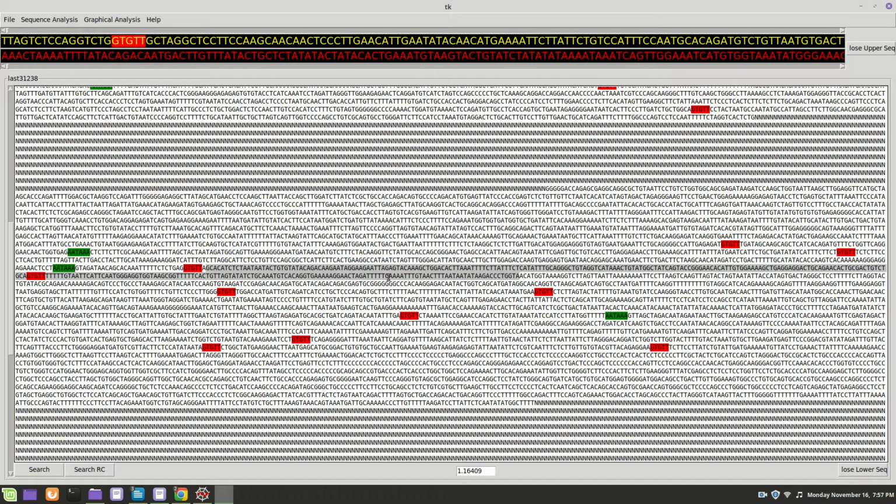All right, so I'll leave that there for you for your particular sequence. But remember, you would just take this sequence, do a dot plot, make sure that you check the find inverted repeats, and if you find two lines near the center line, you compare it to itself, and you find two lines going in the opposite diagonal of the center line. So you have that center diagonal that always cuts through. And if you find two little lines near the center line in the region you want, that's probably the termination signal.